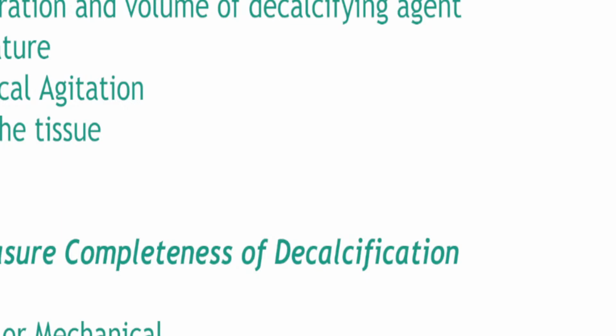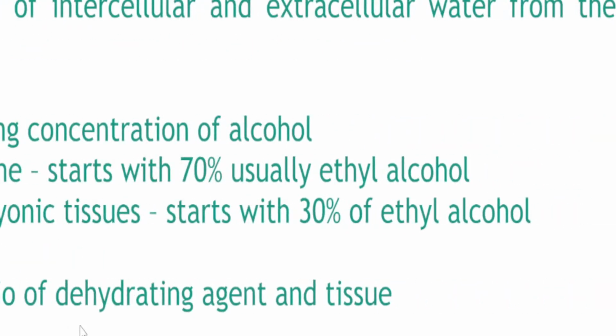This one it'll tell you, because in the calcium oxalate test, if there is incomplete decalcification, the reagent will turn turbid. Okay, and for more information on that one, you need to go to the lecture that Moyo will provide later. Thank you, Moyo, in advance. Okay, next.